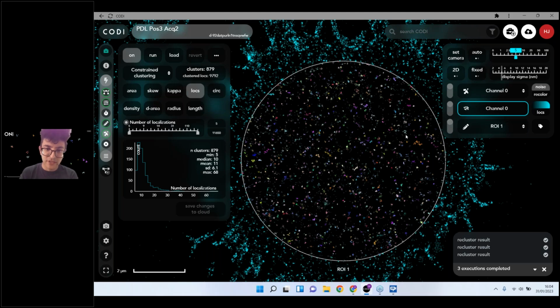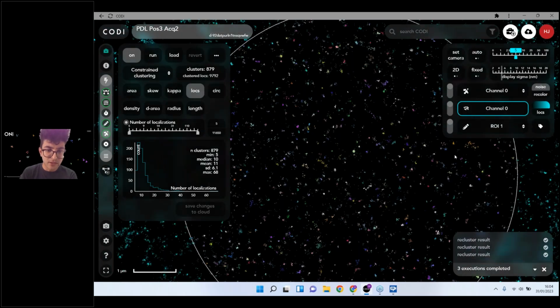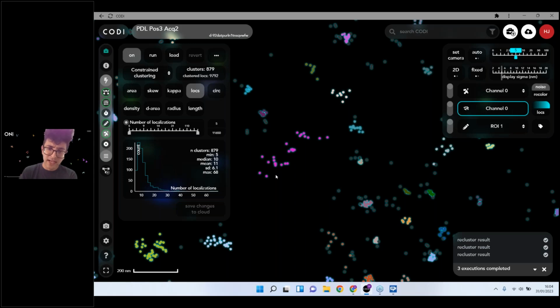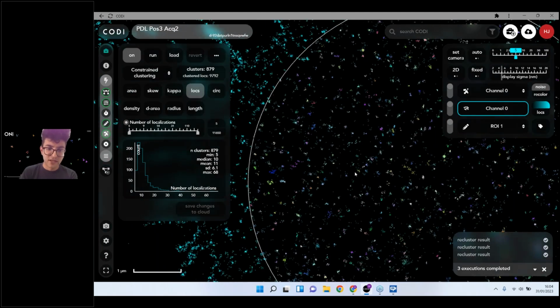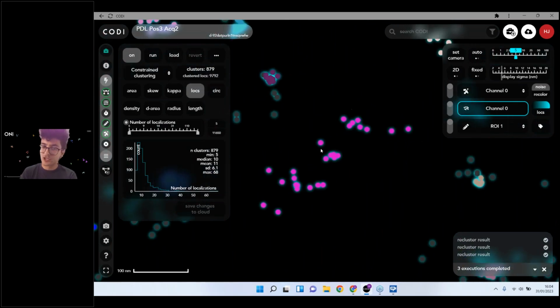And that's partly because it's intelligently choosing that cut, but also because it's probably clustering some things that we might not have done by eye. Now you can see over here, we've got a more sparse cluster, and you can also see maybe on this side, we've got this long stretched out pink cluster. And as we discussed earlier, not all of these clusters are biologically relevant. If we were to look into this pink cluster a bit more, we might say, actually, there's either 2 or 3 clusters here rather than just one.